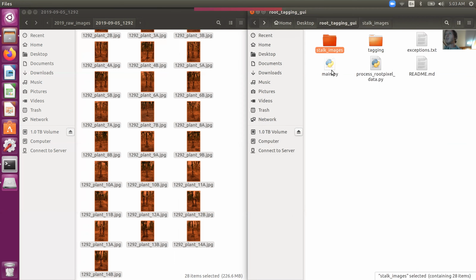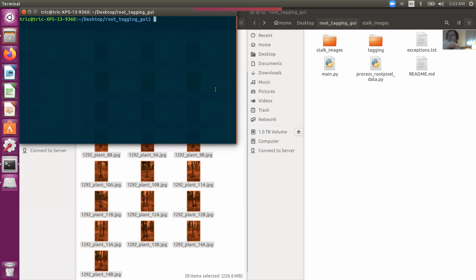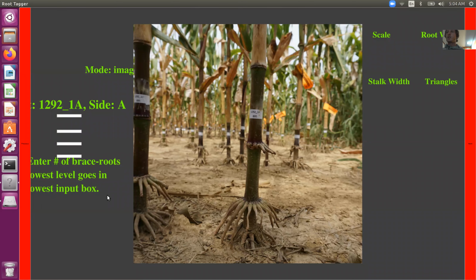And once they're pasted in there, this GUI is going to run from the main.py. And with main.py, you really want to run this on a computer that has a good pixel ratio comparatively to the image data. So this is a 4K screen, so you're going to see pretty high quality images come up nicely on the screen. But I will say that some of the text does change depending on which type of monitor you're using. So here you can see some of the things got cut off, and that's just because we did some of these things pixel-wise or ratio-wise.